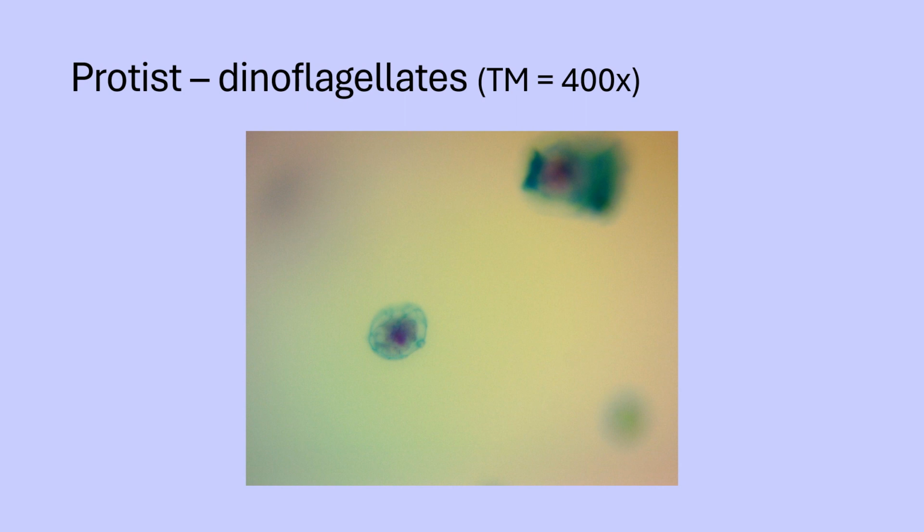And then here's another example, one of our prepared slides. We do have a protist. One example of this is dinoflagellates. Once again, this is magnified a total of 400 times. But these, you can tell, are much larger than what the two previous slides were of those specimens.